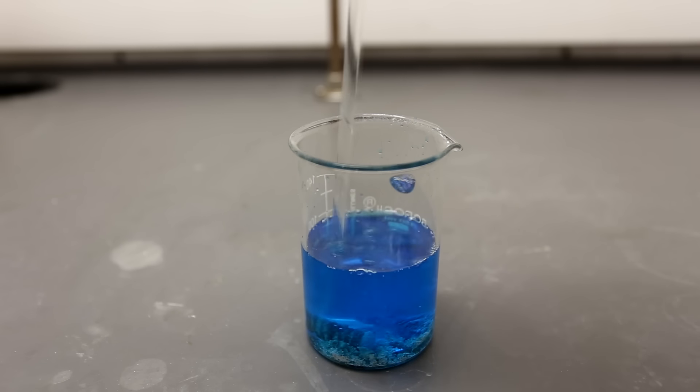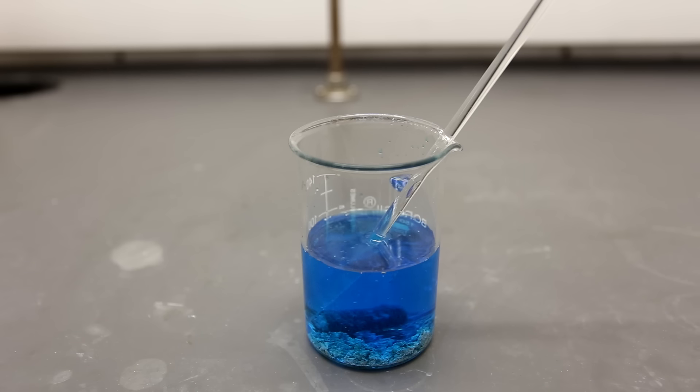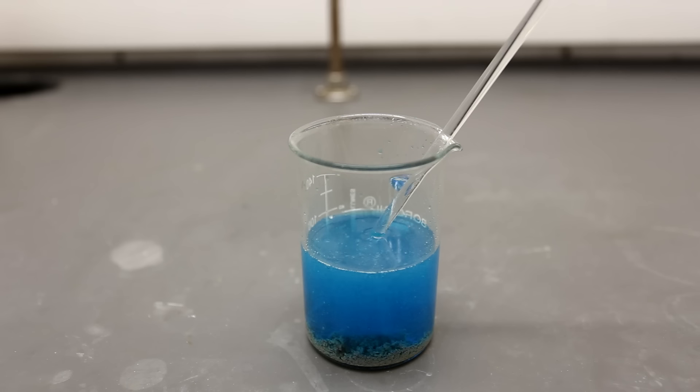Every so often, you can poke the copper pieces to dislodge the silver that has precipitated. You should also occasionally stir the solution. It is going to take quite a while to react, so I suggest leaving it for a while and coming back. Eventually the reaction will be done and you will know this when the bubbling has stopped and the solution has cleared.